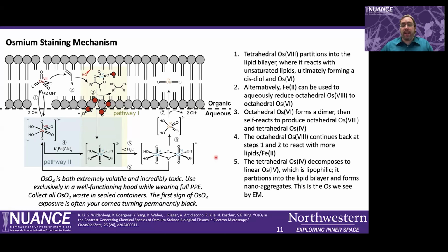The downsides of osmium staining are really entirely around safety. Osmium tetroxide is very volatile and it is extremely toxic. So when you're using it, it's really important that you use it exclusively in a well-functioning fume hood while wearing full PPE. This is why if you use the osmium coater in EPIC SPF, that osmium coater lives in a hood, and we very, very strongly request that you never try and change the osmium crystals yourself.